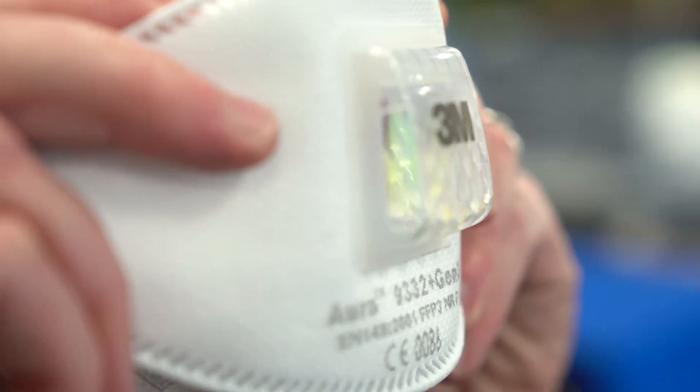The old version had a typical white rubber exhale valve, so when you breathe out, this foil allows airflow to flow 36% more freely than the white rubber, therefore keeping the inside of the mask cooler and more comfortable for the wearer.